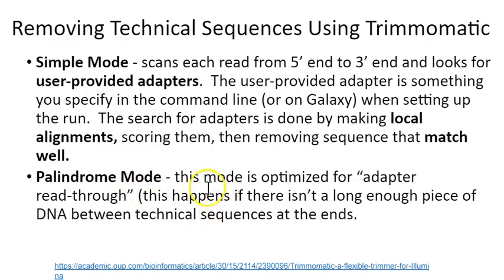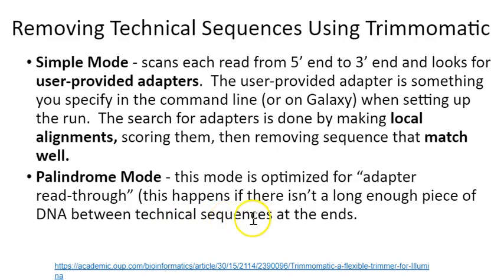Palindrome mode is a mode that's been built into Trimmomatic to optimize for what's called adapter read-through. If there isn't a long enough piece of DNA between the technical sequences at the end, you'll get read-through where the sequencing will run right into the adapter sequence on the other side from where it starts. That can be problematic in the data, and the palindrome mode in Trimmomatic enables removal of that.